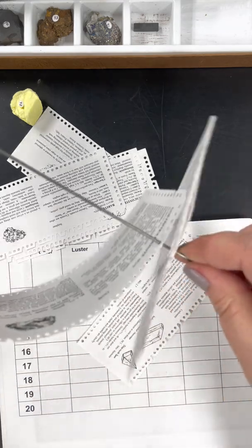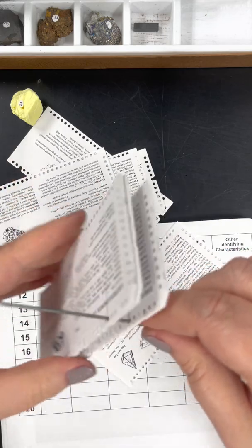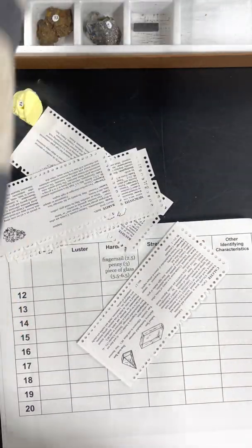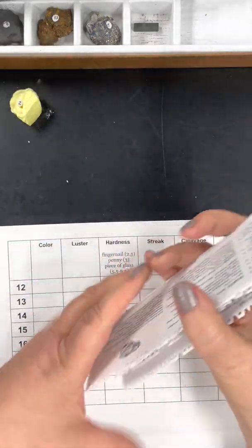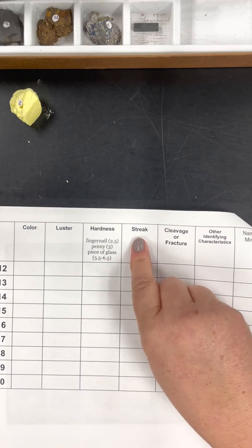And again, always try and fan them out. Make sure you don't have any cards that got stuck. Okay, great. Remember, if it's left on the rod, I don't want these. So discard those. And it looks like I only have 5 cards left over. Nope, 6. I've got 6 cards left over. Great. So now we're gonna get to streak.